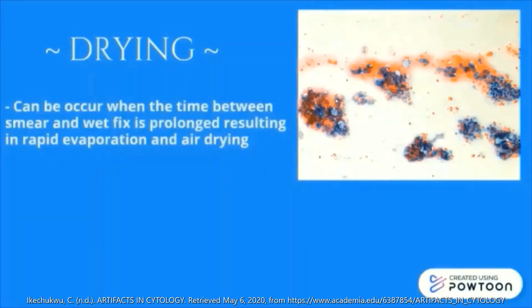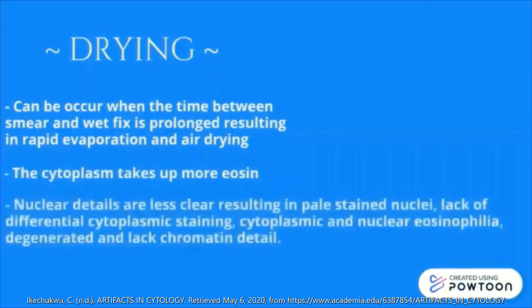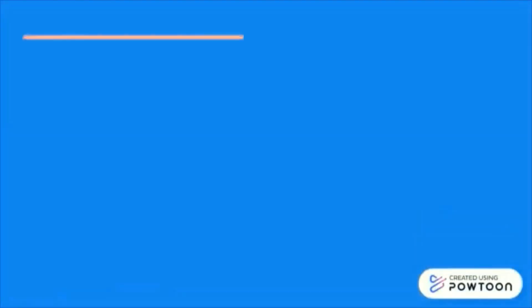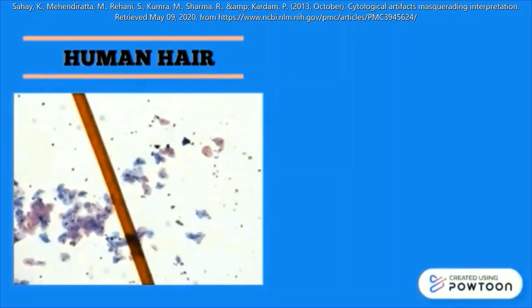Drying can occur when the time between smearing and wet fixation is prolonged, resulting in rapid evaporation. This causes the cytoplasm to take up more eosin and makes the nucleus and chromatin details less clear. The next artifact is human hair.